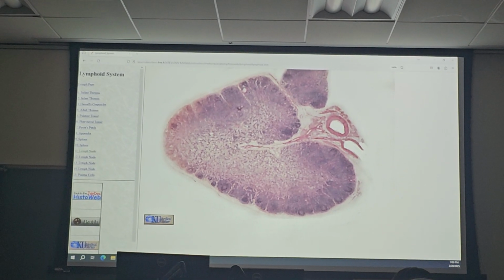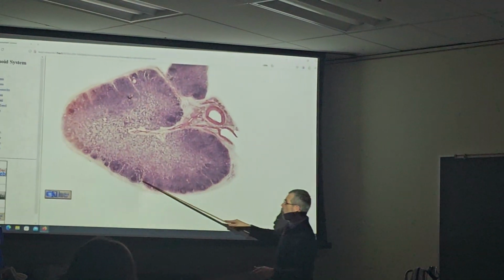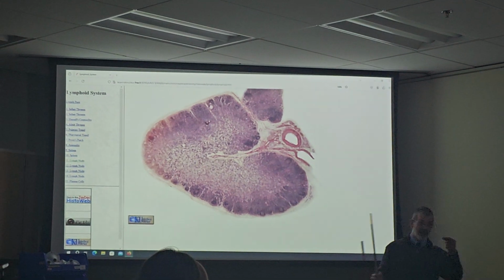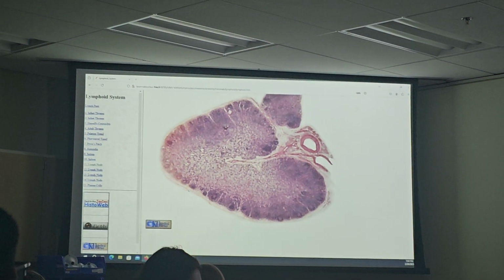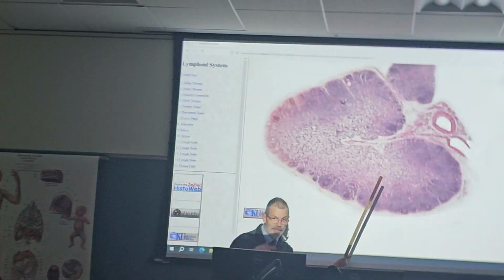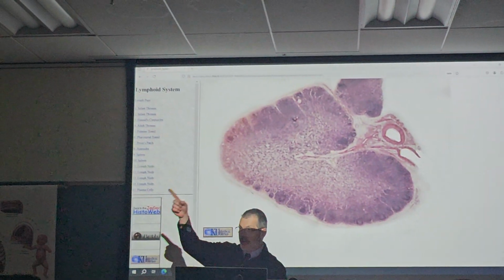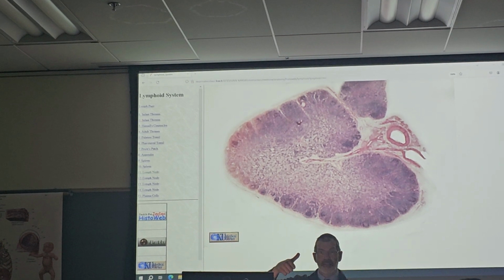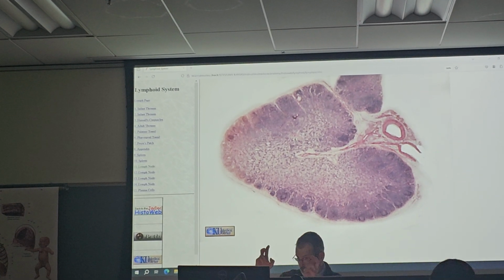Come on the outside. You take my pencil or whatever, I kind of make a ring, one ring of darkness, one ring to bind them all. So that's a lymph node. Lymph has the dark on the outside only, it's one layer, and it has light on the inside, one layer. So one ring of dark, a bunch of light, lymph node. Make sense? Dark and light, 2 layers.